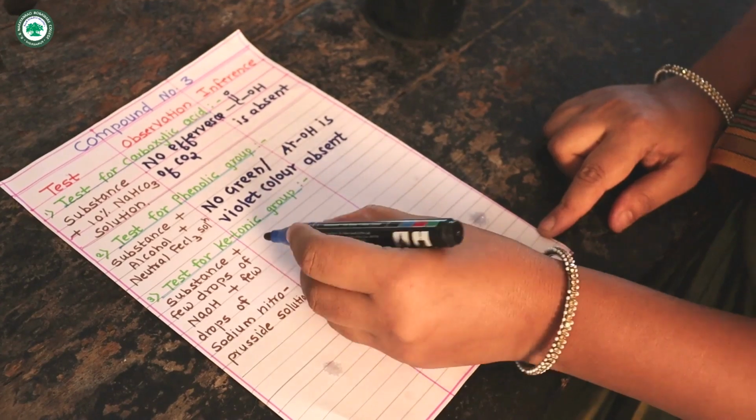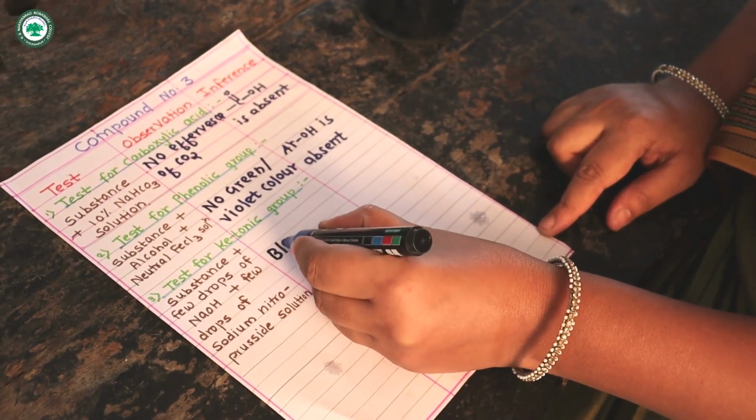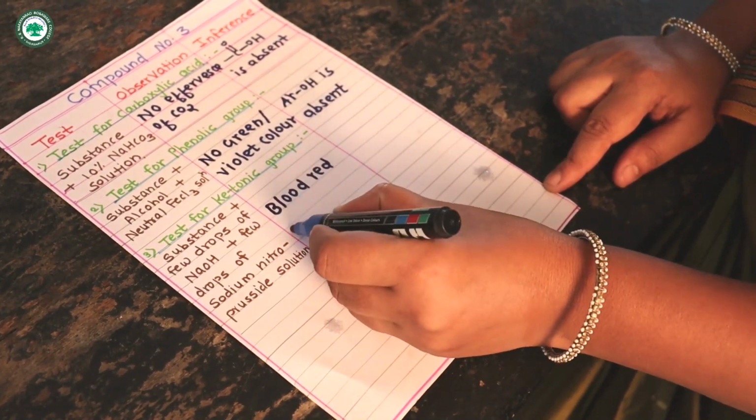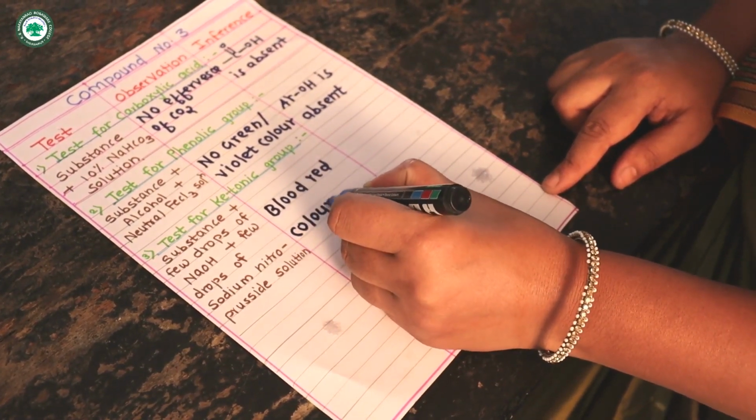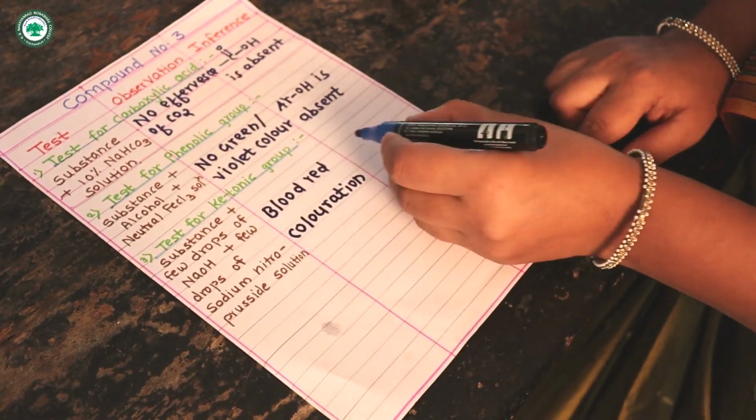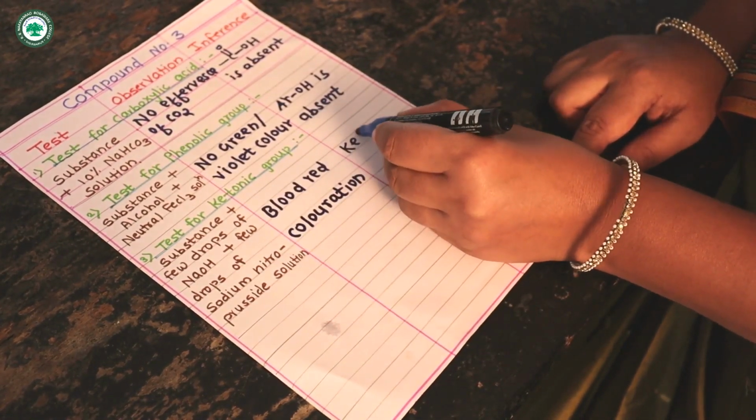Now observation, blood red coloration, therefore ketonic group is present.